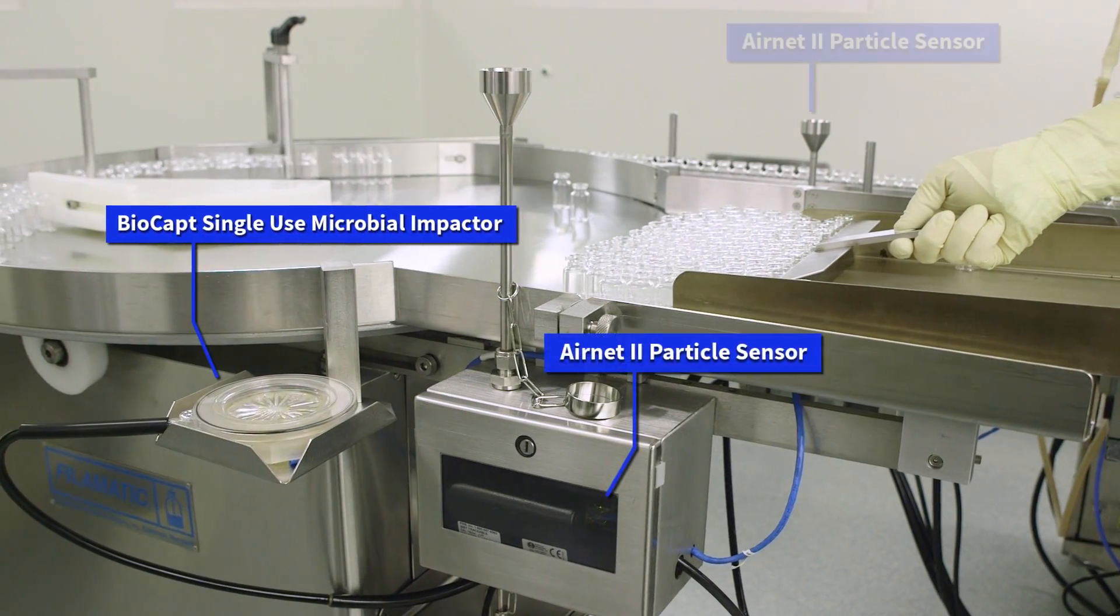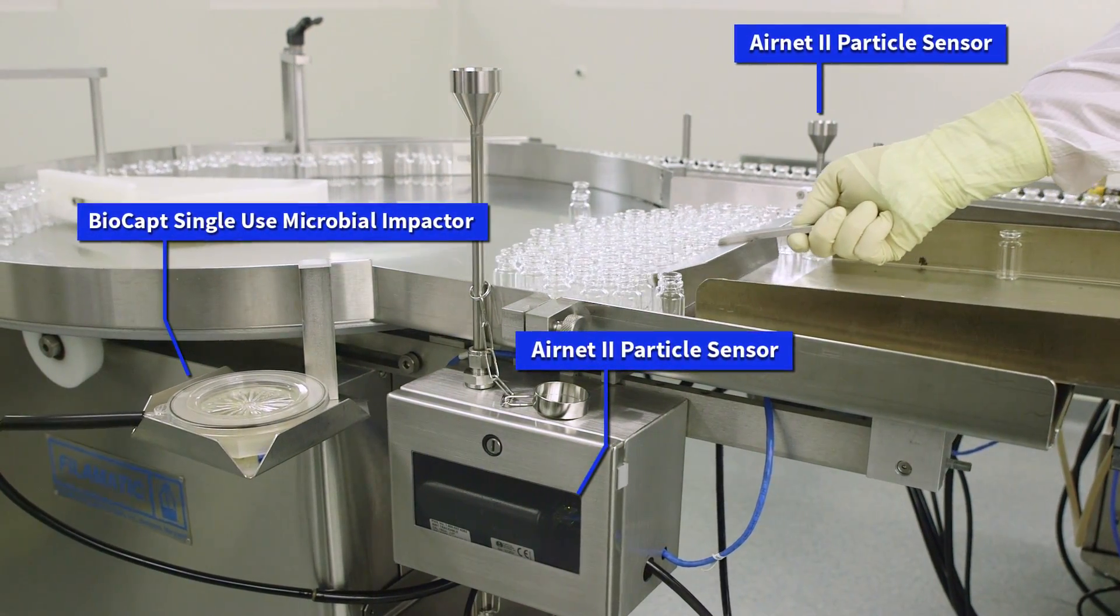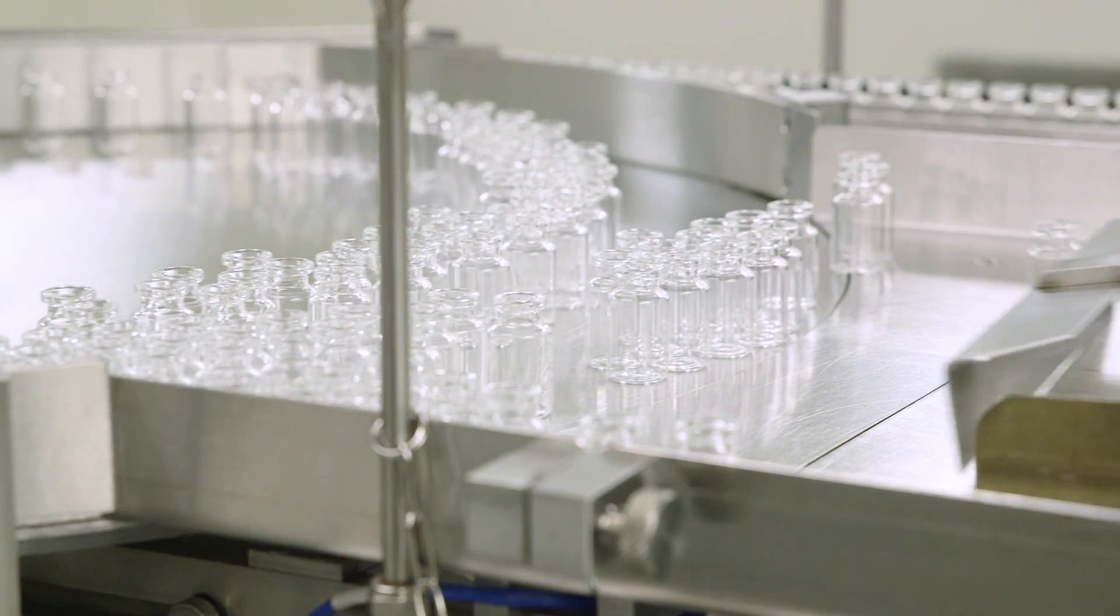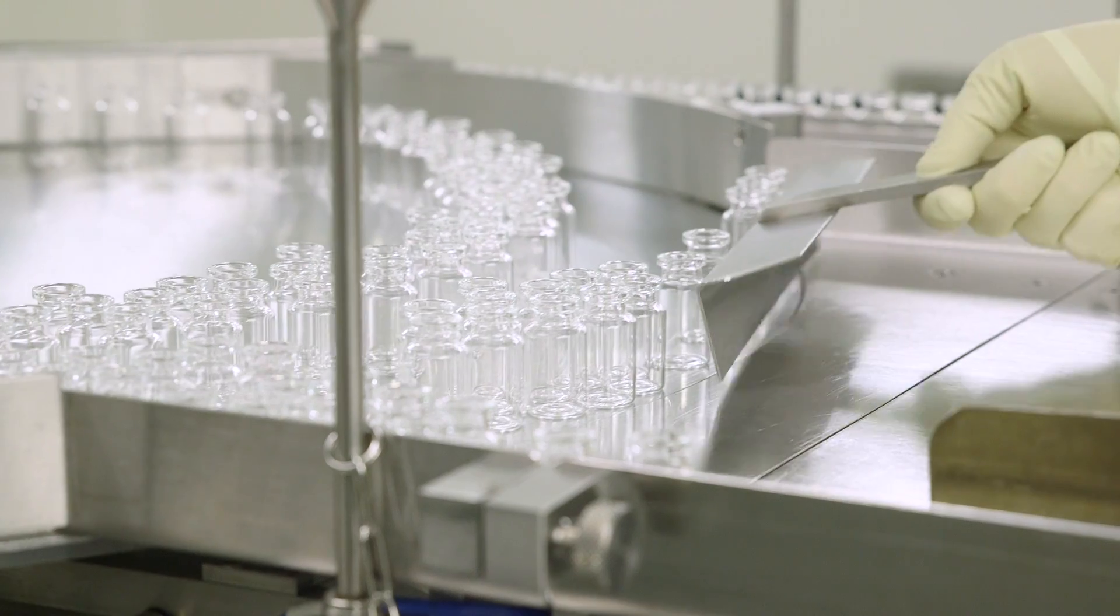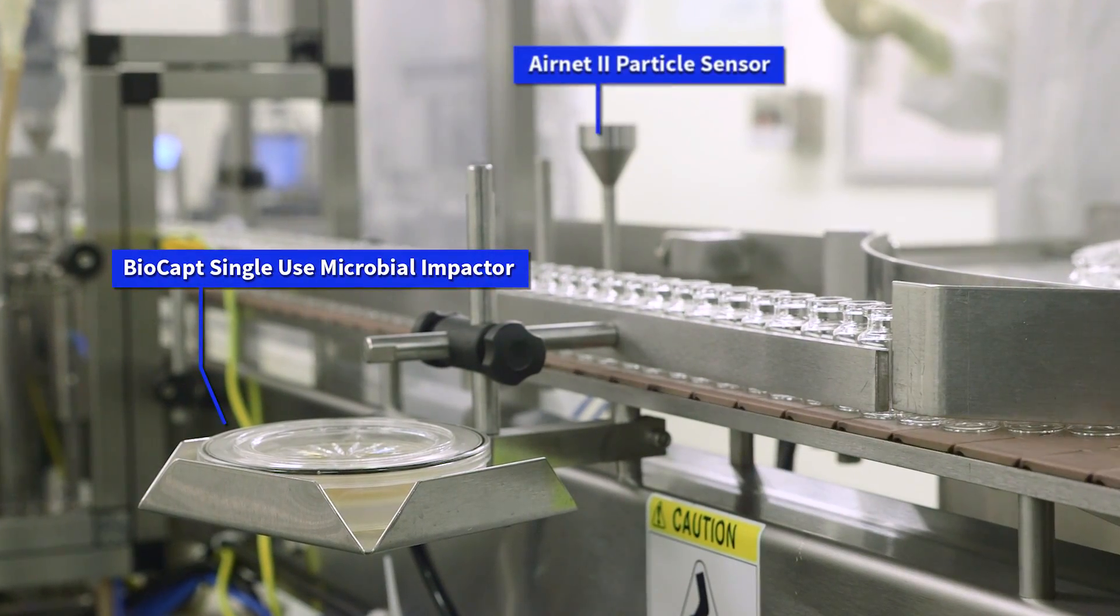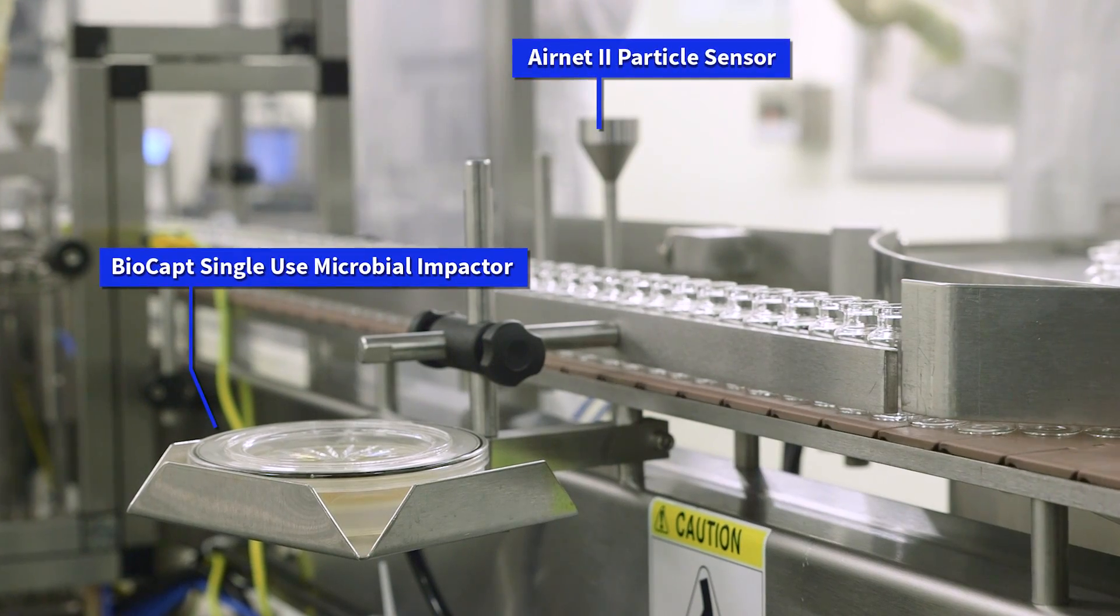Monitoring of the manufacturing process begins where the first contamination may occur. Particle and microbial monitoring is conducted where the vials are loaded onto the accumulator. Monitoring continues while the empty vials are transported to the filling operation.